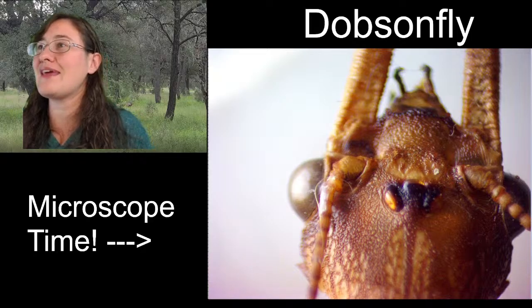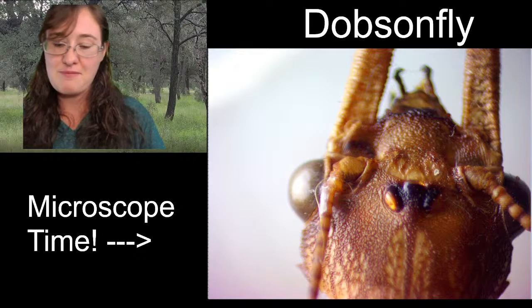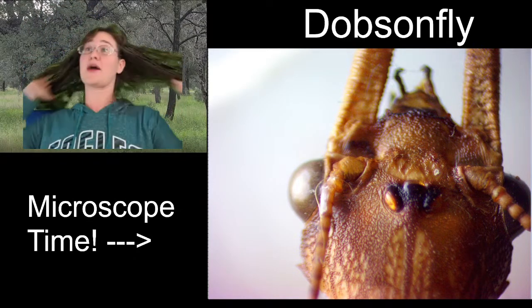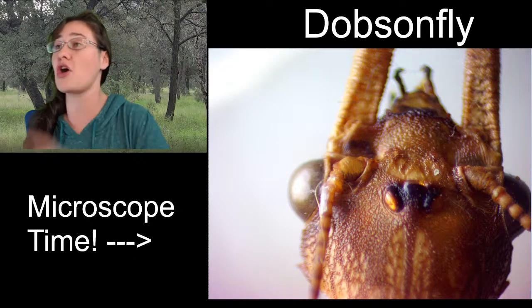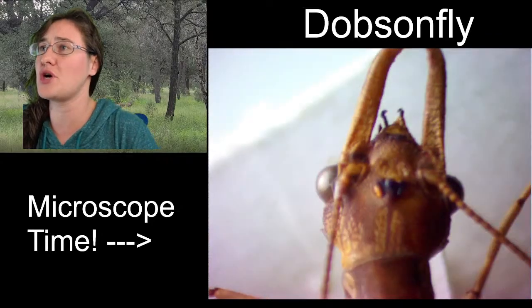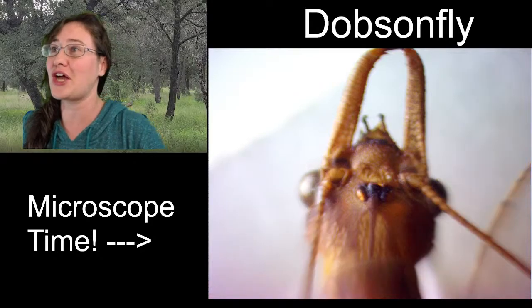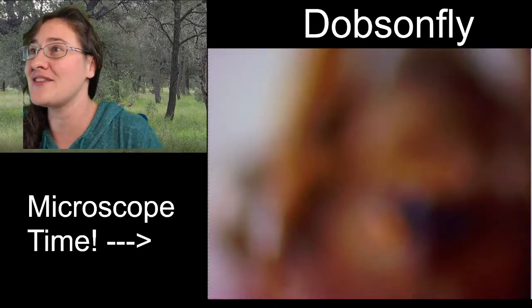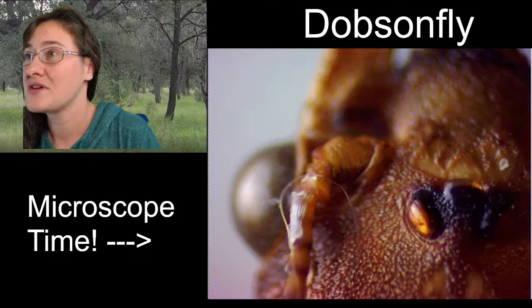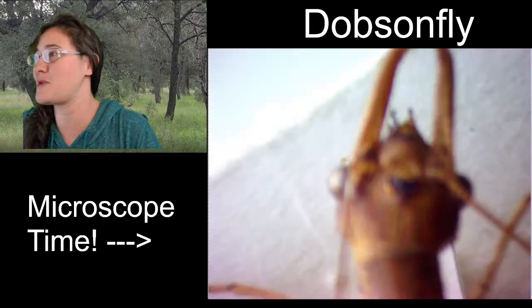We're gonna be really gentle with it for a little bit of time to make sure that that antenna doesn't get bumped while it's drying. And then when it's dry, all the way dry, I might come back under my microscope and add just a little bit of glue around the edge where it connected. But I think the shot was pretty good. The antenna is right there on the end of the pedestal. I'm pretty happy with that. You're not going to get too much better when you're gluing a specimen back together.